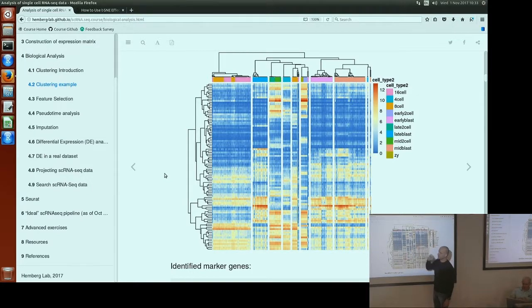How do you decide the members of those sections? These ones? Yeah. We just run it. It's the package that plots this heat map. It has a k-means parameter; you just say 100, and it will run k-means on the real gene values.